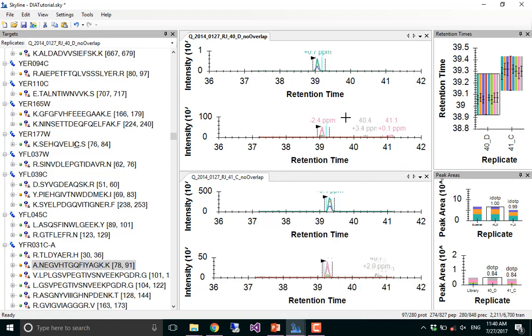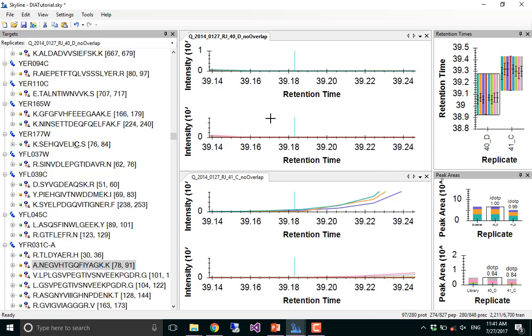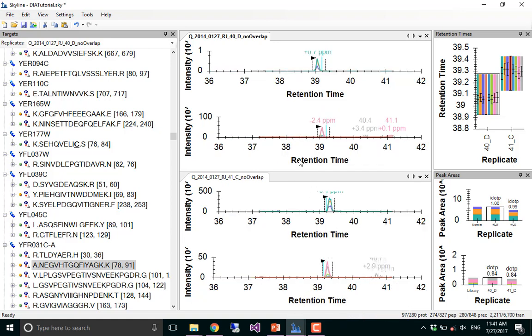And now it shows this subtle little blue line for where the identification maps to, right? So Skyline imported plus or minus 2 around this. Wow, it's really hard to see, isn't it? There's a blue line there, I promise. Okay, so hopefully people see the blue line.